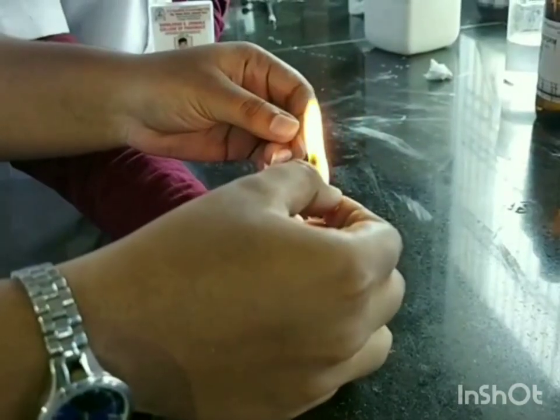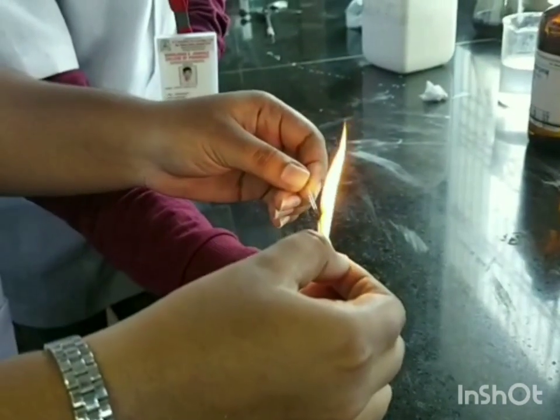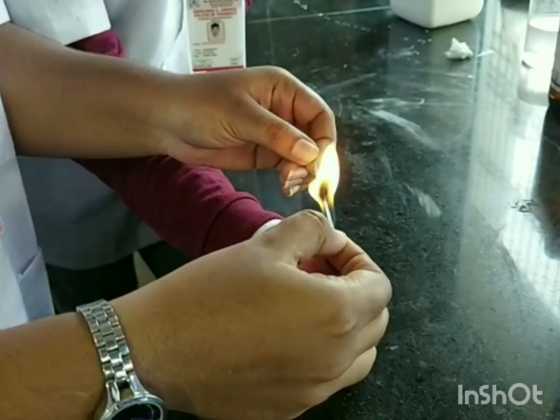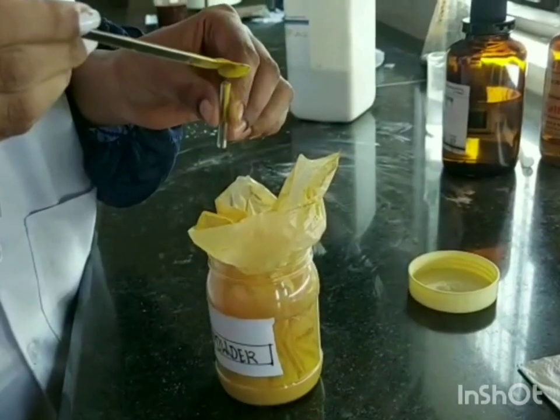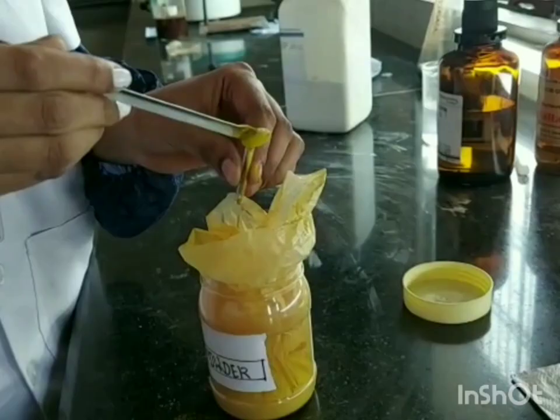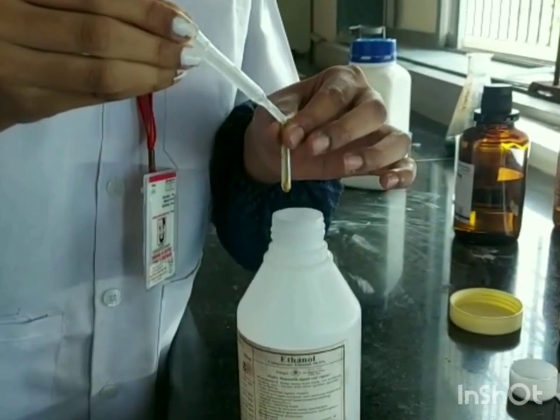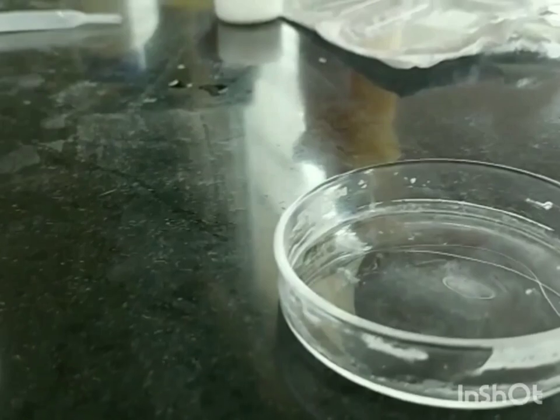We need capillaries for spotting of standard and sample. Make sharp ends as shown in the video. Take turmeric powder as a sample in a fusion tube. Add ethanol in it as a solvent. Close the fusion tube with silver paper and keep it aside.